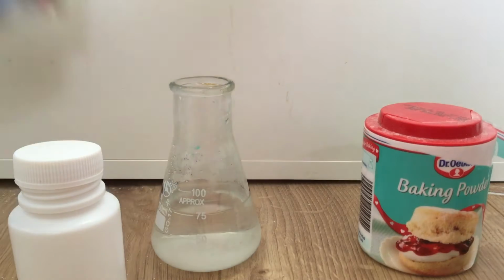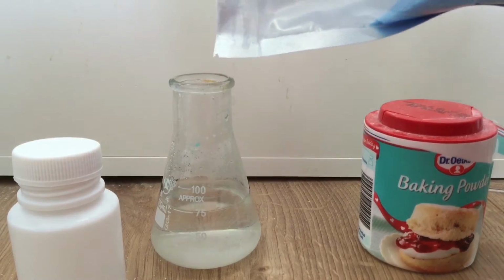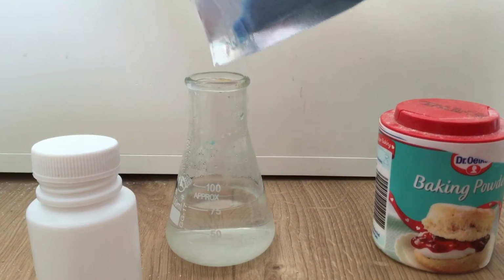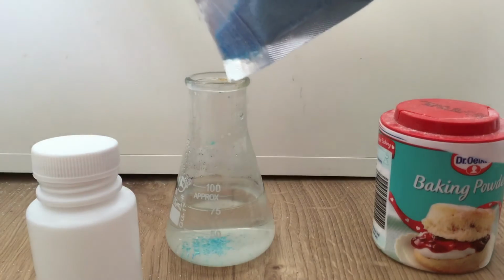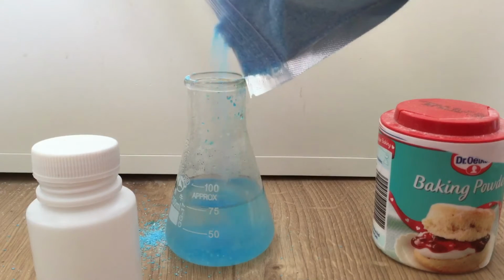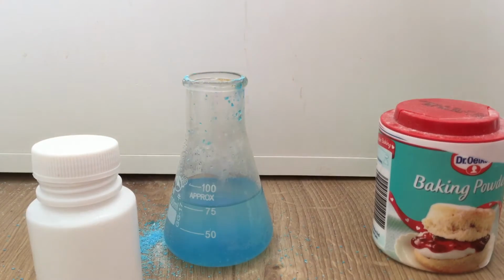Now you get your copper sulfate. This is copper 2 sulfate, not copper 3 sulfate. And you pour it in. I know I have a funnel somewhere, but I'm horrible at editing, so I don't really wanna. Let's just try. You can pour in a random amount. Not too little, not too much. Just use your common sense here. That will probably be enough.